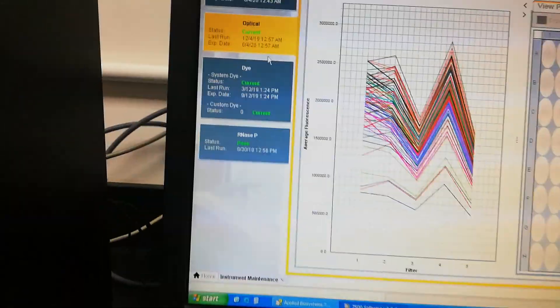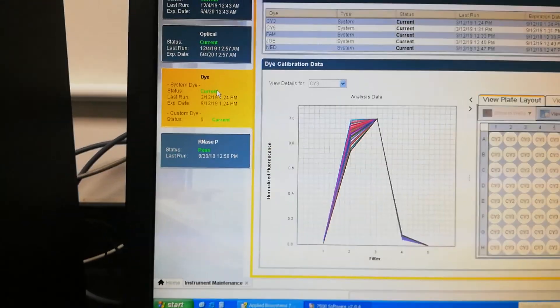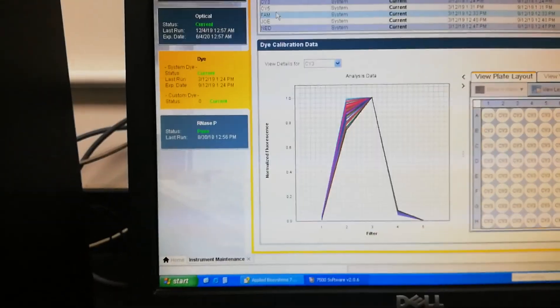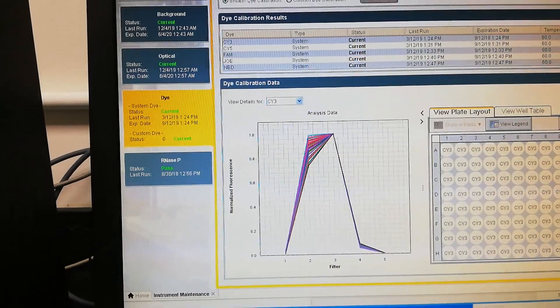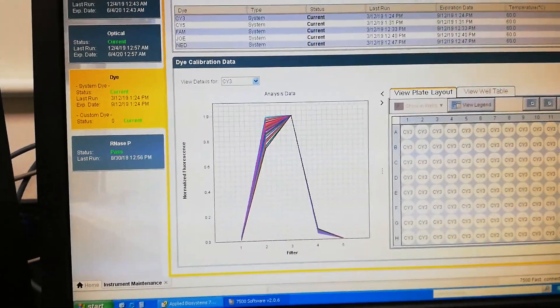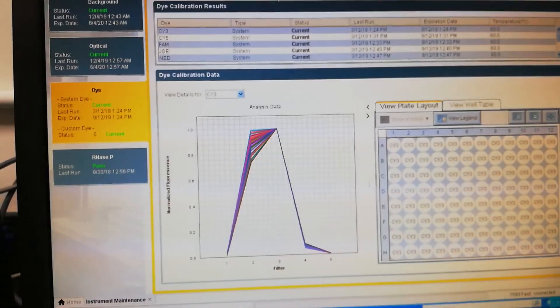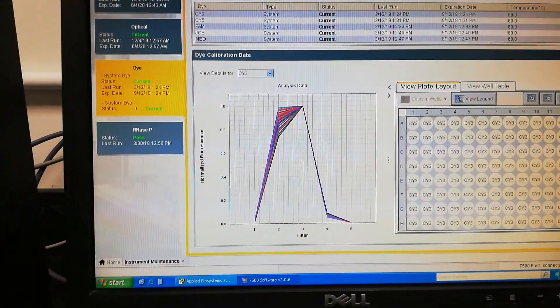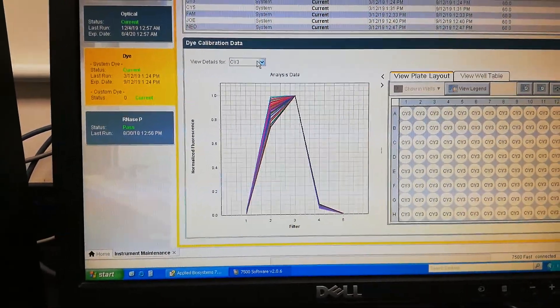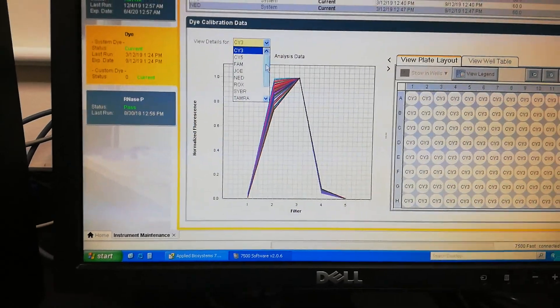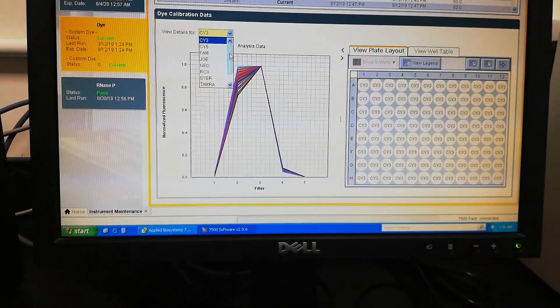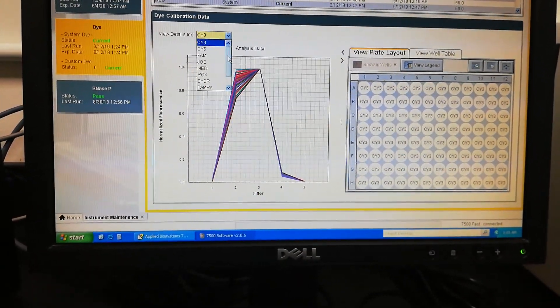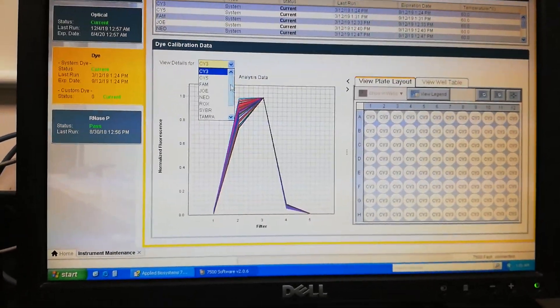Here in this dye calibration, there are two options. One is system dye calibration and another is custom dye calibration. It is preferred to go with the system dye calibration. Here you can select the type of dye which is of your interest.